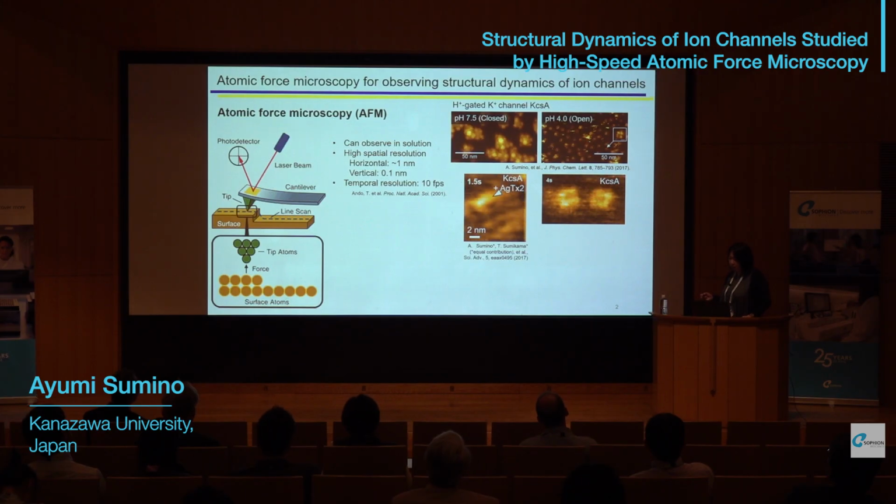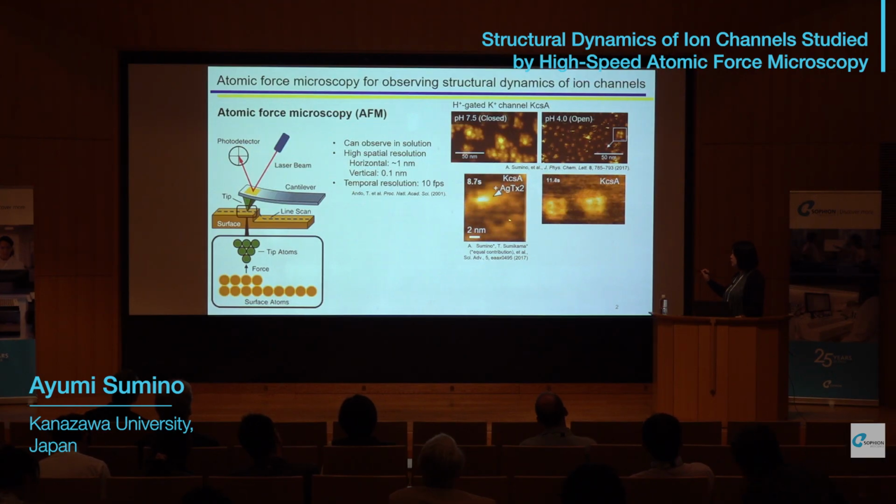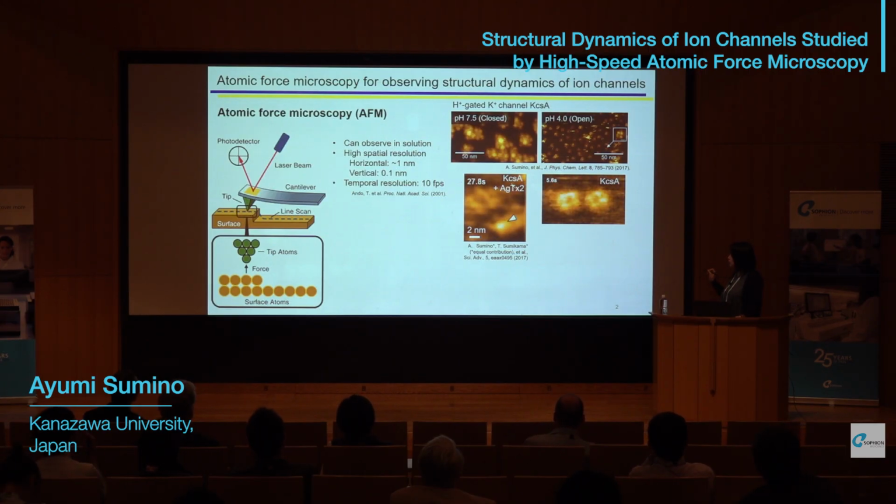And here is a toxin binding event onto the extracellular surface of the potassium channels. Binding and then dissociated. So we applied scorpion toxin into the buffer solution and captured this movie. And we could analyze the binding dynamics using this movie.